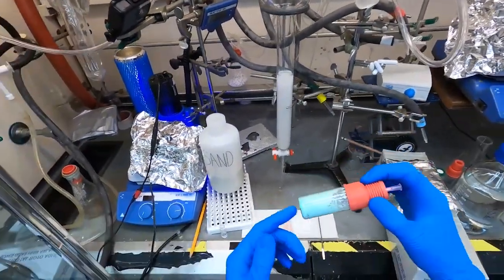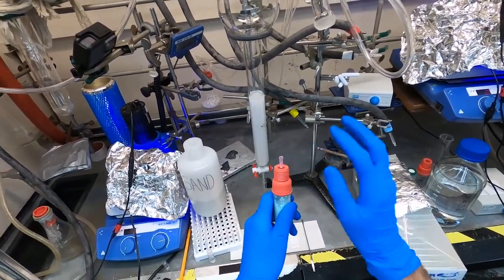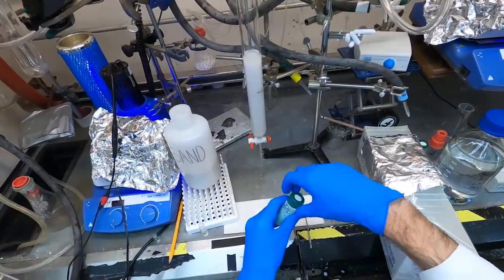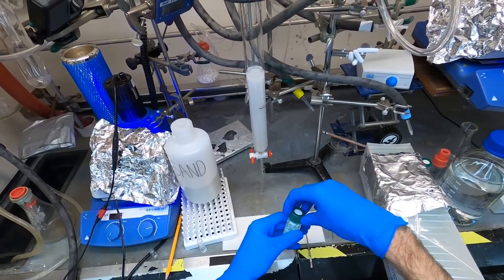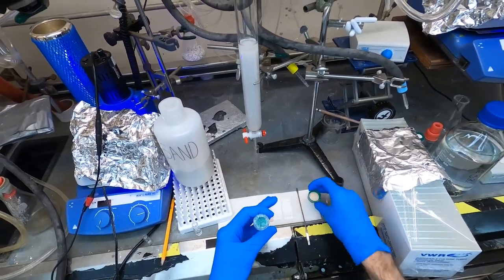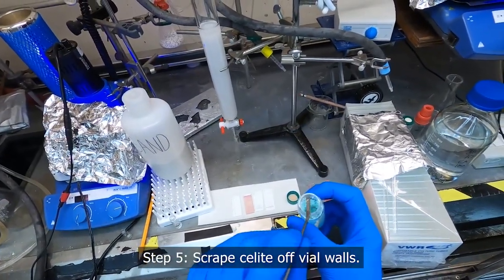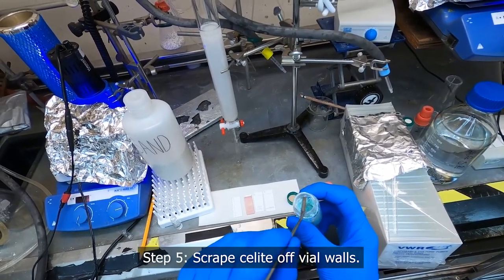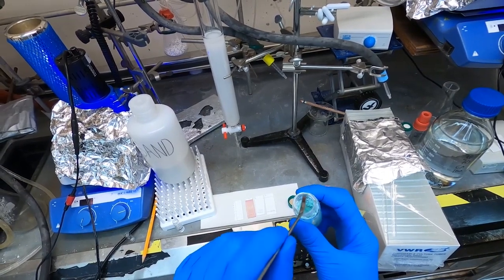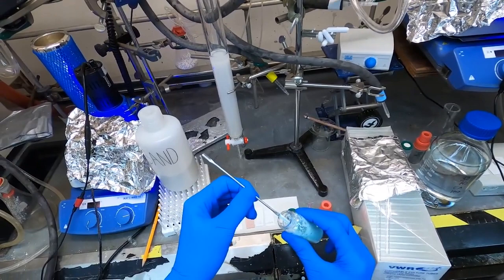Okay, so here's our dry load right off the rotovap. Give it a couple taps to kind of knock down any loose stuff. And you want to take this off carefully just to make sure that nothing blows around. And I always start by scraping the Celite very carefully out of the top part of the lid here. And I just work my way.